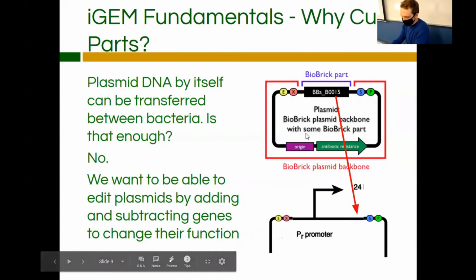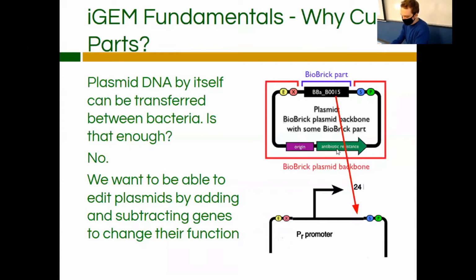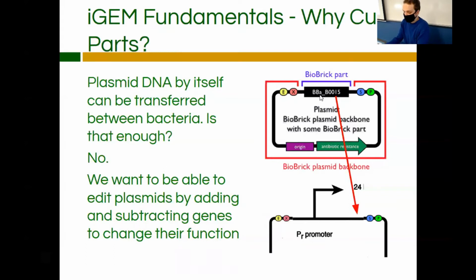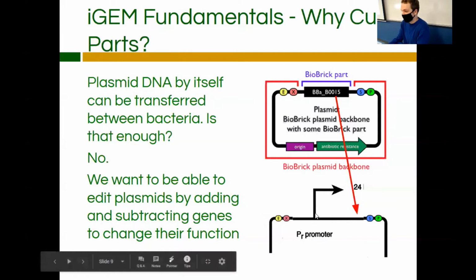It's the standard backbone, your origin, your antibiotic resistance. Here's the part itself, and then it has restriction enzyme sites on both sides of it. I'll be going on to those more in the next few slides, but say, for example, your goal is to have your promoter in front of your part because this part by itself is not going to do anything. It's just a coding sequence for a protein, and without a promoter to actually enact it, it's not going to translate it properly. So our goal here is to get this part and put it downstream from the promoter in order for the promoter to activate it.